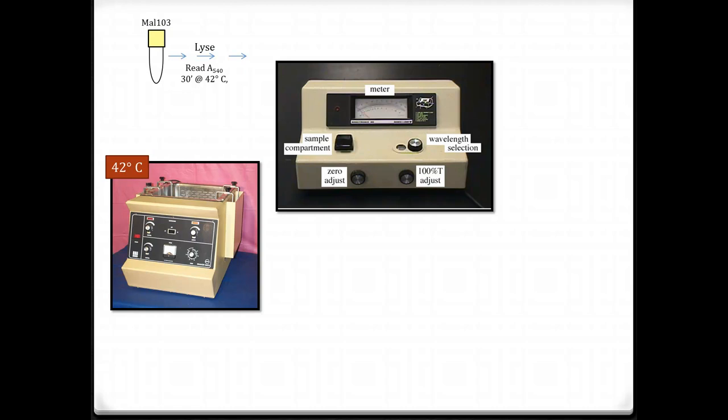During that incubation, you'll get some instructions from your TAs. They'll show you where some things are, some last-minute prep, and then you can label your plates, set up your dilutions, chat with your partners, write in your notebook, whatever it is you want to do.